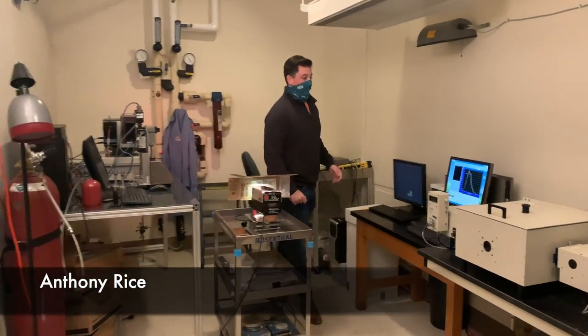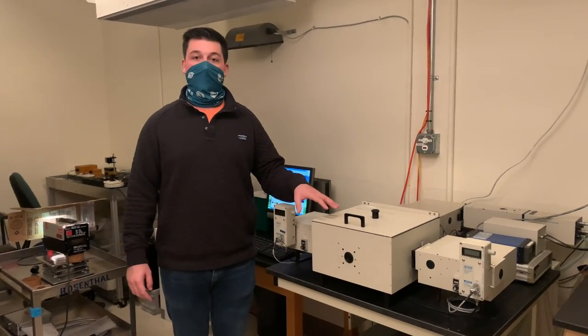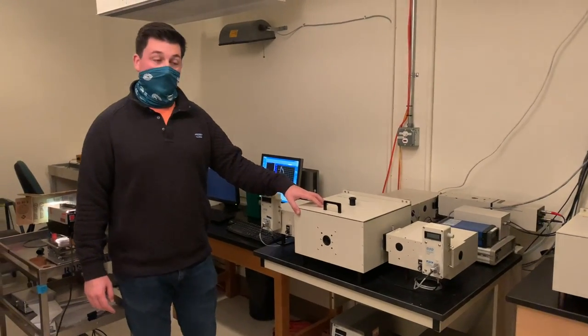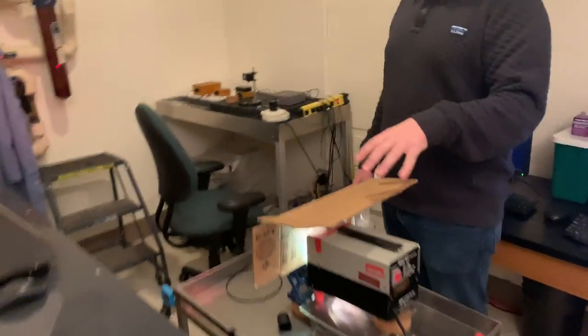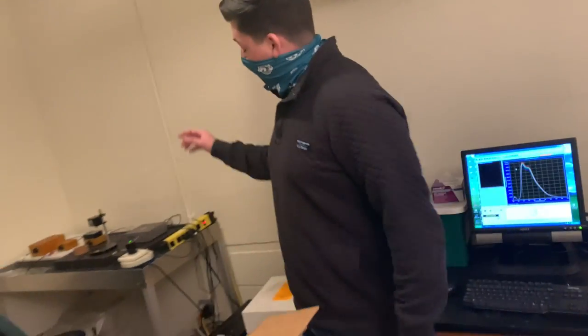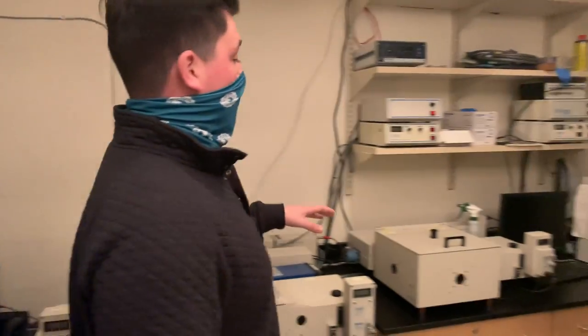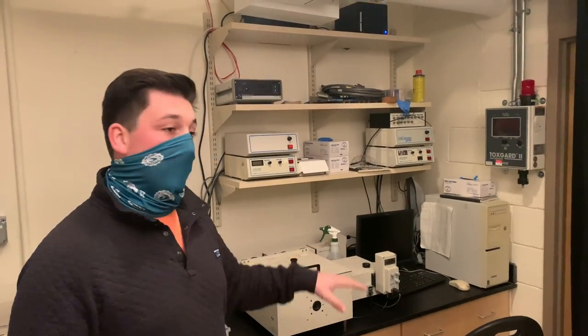Welcome to the photochemistry lab. This is where we do all of our photochemistry for our tetrapyrrole projects. Here we have one of our fluorimeters that we use for our singlet oxygen studies. We also have a light source with a variety of light filters in order to irradiate our samples at any particular wavelength. Over here we have a UV-vis spectrophotometer for our absorption and Beer's law studies, and then we have our second fluorimeter used for emission studies.